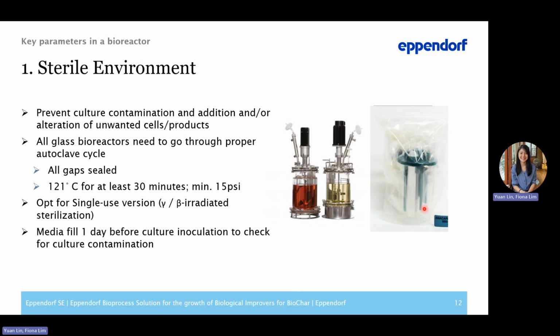Some other checks that operators could potentially do is to fill the culture media one day before you actually introduce the strain into the culture, just to make sure that the operations are all done in perfect condition before you introduce the cells into the bioreactor.